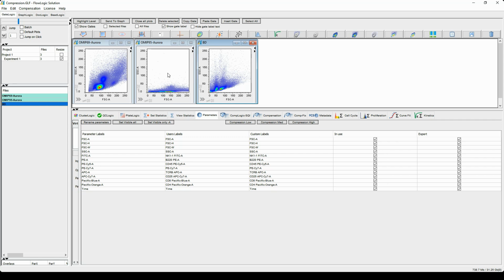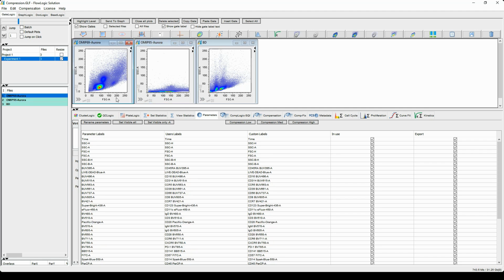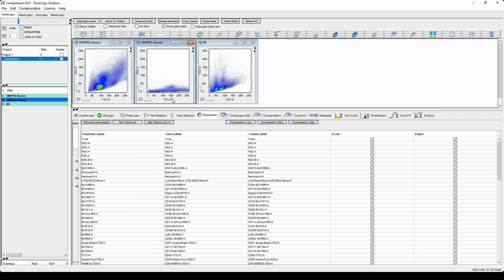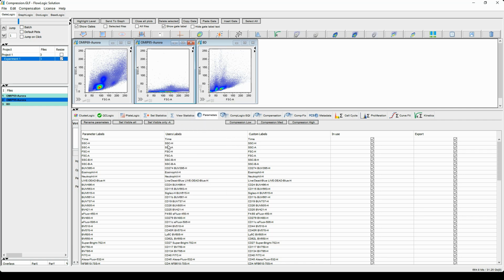Another important tool that we built is set visible parameter or hide parameter. Now, these two files are files with 40 colors. This is probably a file with 45 or 50 parameters. This is a file with around 90 parameters. And you can see that the set of parameters is enormous. Now, when we go to set visible only area, you can see that all non-area parameters get removed.